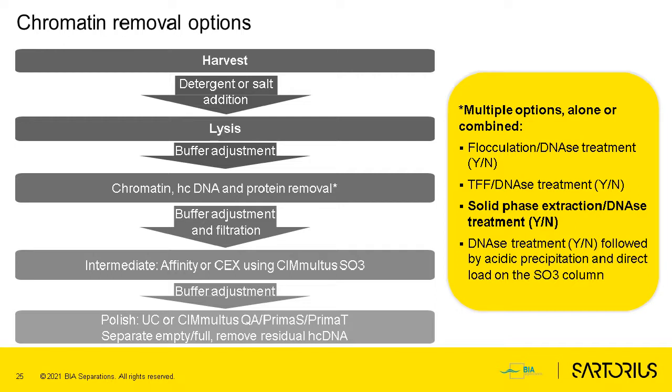We try to avoid detergent because scaling up with detergent might be an issue. Micelles are formed and scalability is not very straightforward. With salt you would have fewer issues, but if you use salt, then you need to use a salt tolerant enzyme. We have a product for this, which we call Kryptonase. So this is salt.